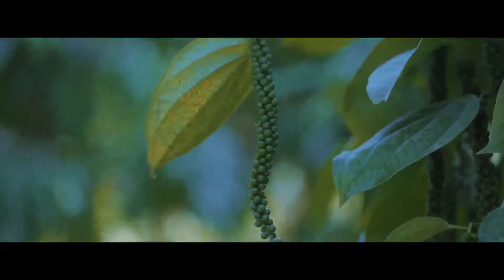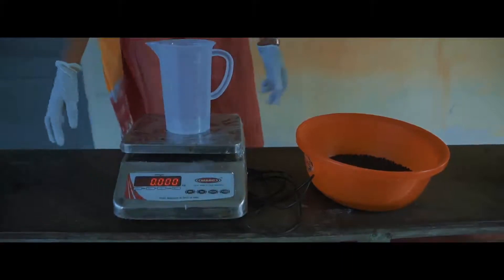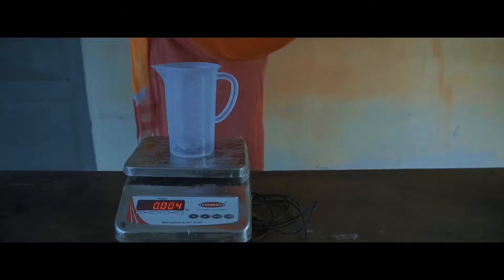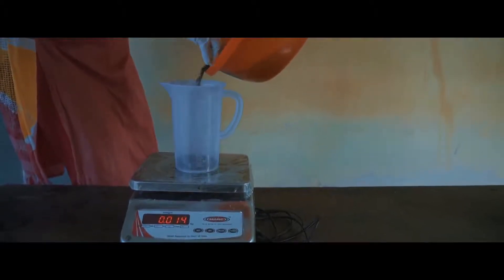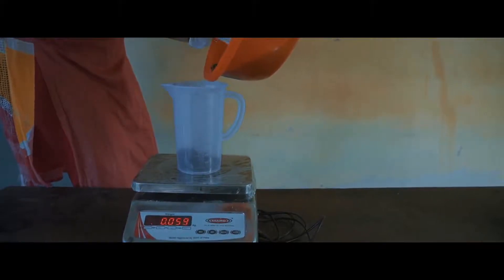You will need a 1 litre capacity measuring jar and a small electronic weighing scale. A plastic measuring jar might cost less than 100 Indian rupees or about 1 US dollar, and the weighing scale will cost about 400 Indian rupees or about 7 US dollars.